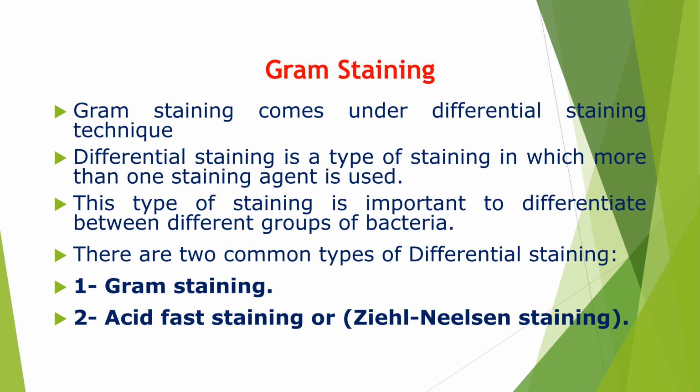Hello everyone. Today we are going to discuss the gram staining technique. Already we have discussed the simple staining technique, a very simple technique. And today we are going to discuss gram staining, which is also called a differential staining technique. So let's see what is there in the PPT.